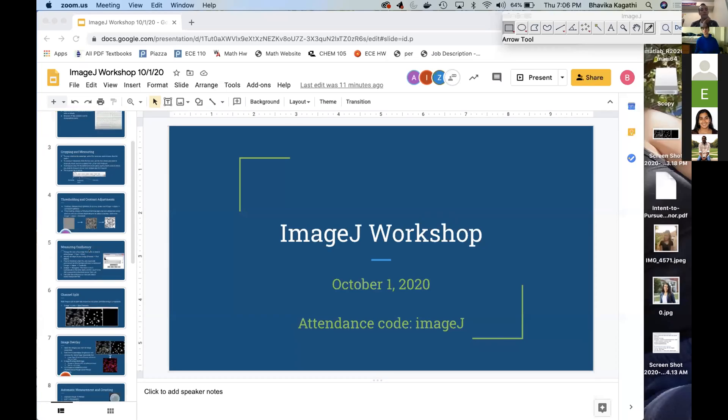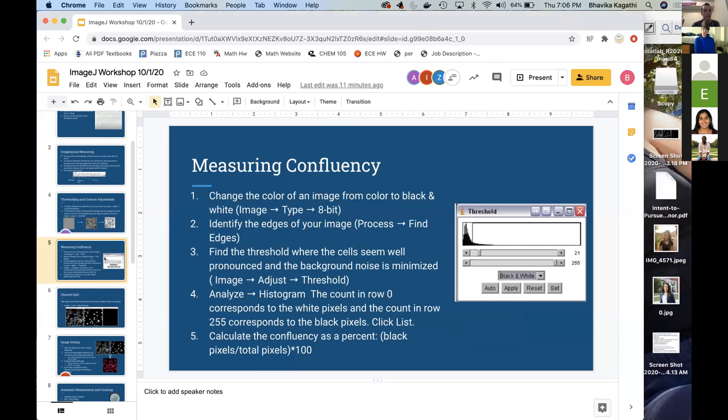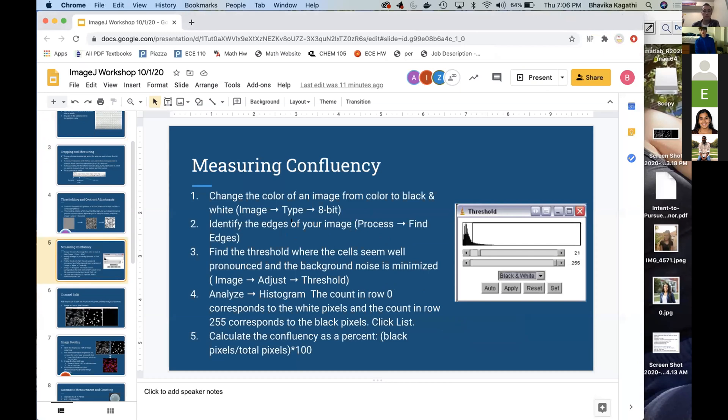So now we're going to talk about measuring confluency. Measuring confluency is generally used when you have a lot of cells or something like that and you want to see what kind of area those cells are taking of your total image or total, for example, a well in your cell plate.